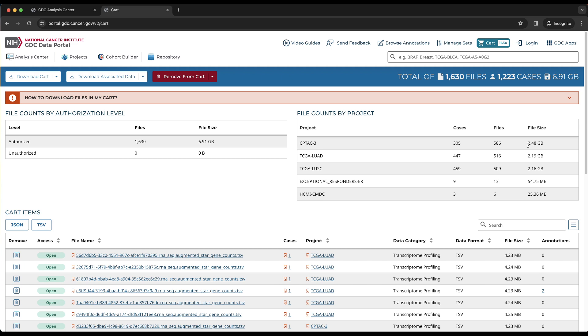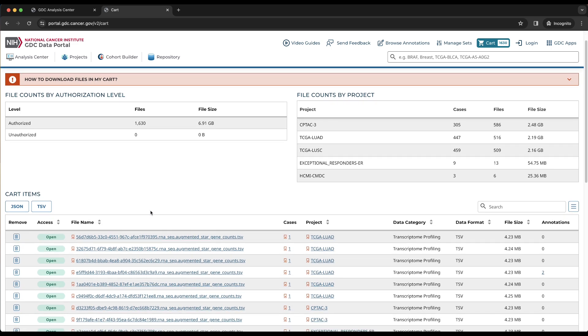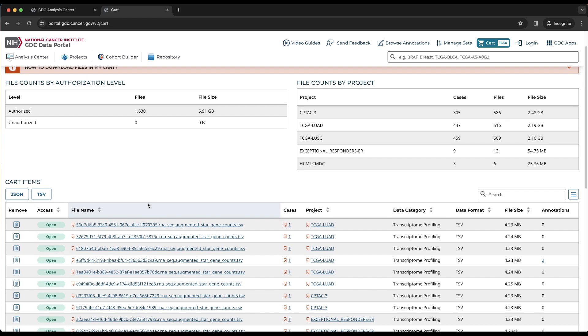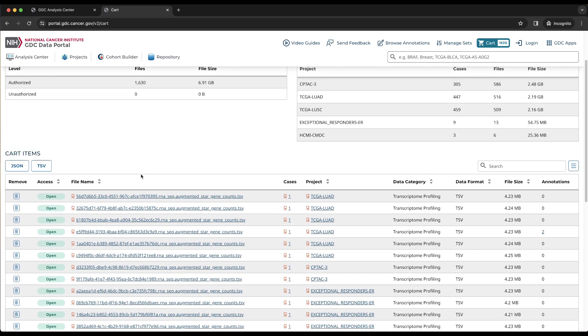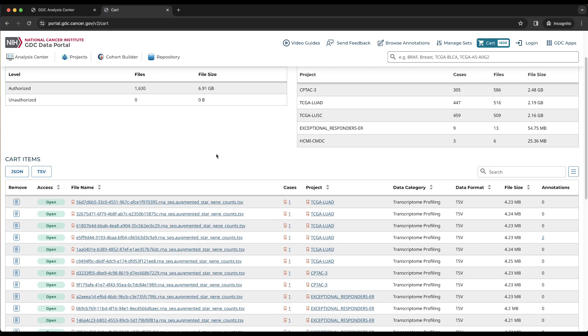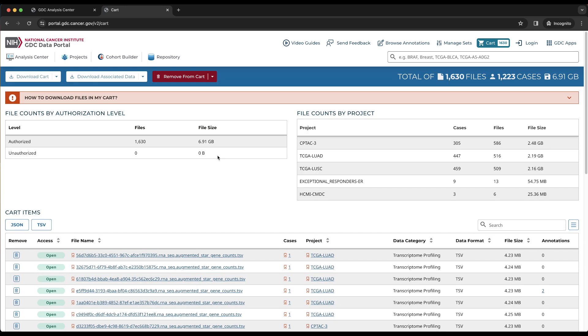The bottom table provides a list of files in the cart with a similar design as the table in the main repository page. The main difference is that instead of a button for adding files to the cart, the first column contains a trashcan button to remove each file from the cart. The top has three options from left to right: Download cart, download associated data, and remove from cart.